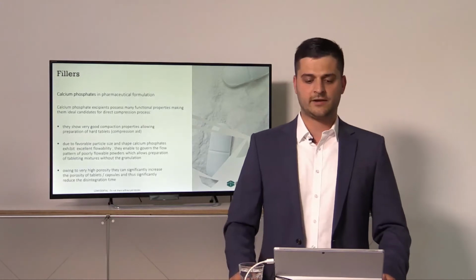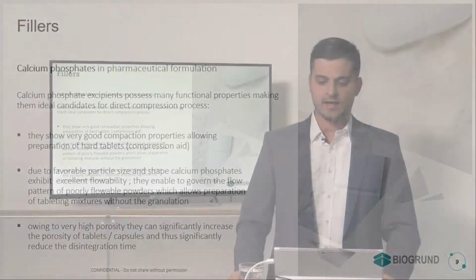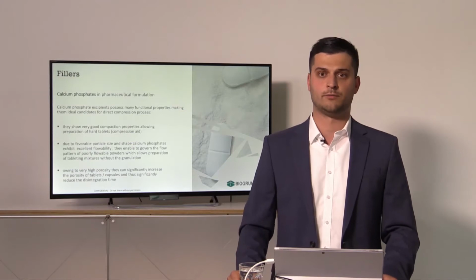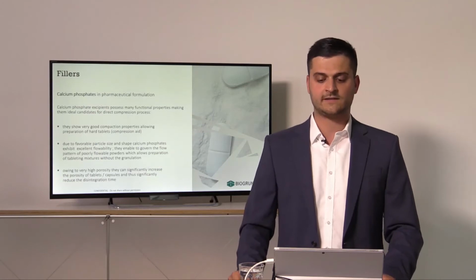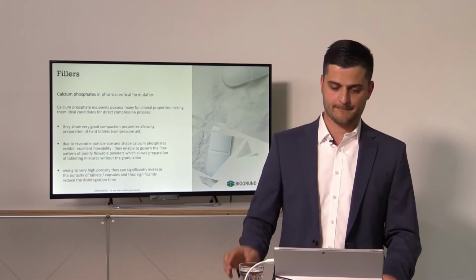All in all, we can conclude calcium phosphates have really good compaction properties, allowing preparation of hard tablets. Calcium phosphates exhibit excellent flowability, and they enable governing the flow pattern of poorly flowable powders, so they are helping. Owing to very high porosity, they can significantly reduce the disintegration time.